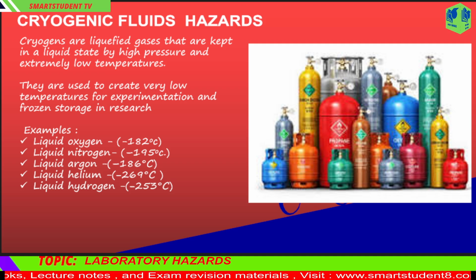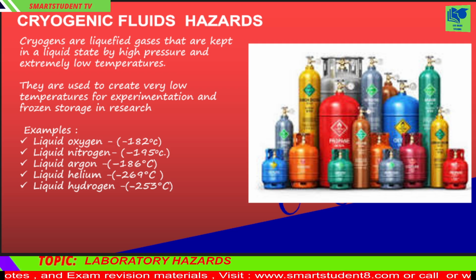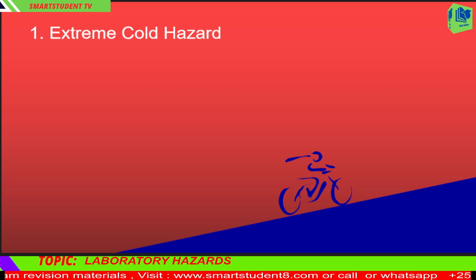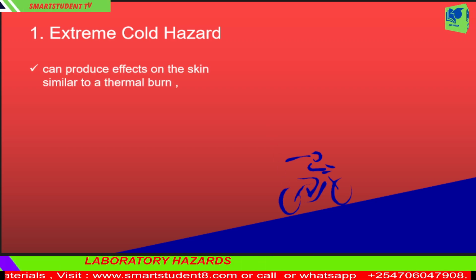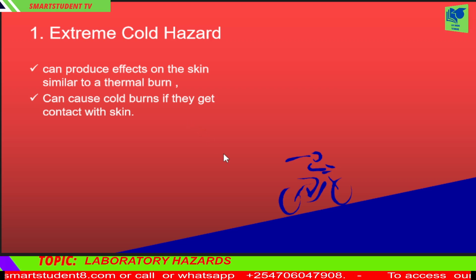There are 3 groups of health hazards associated with cryogenic liquids: extreme cold, asphyxiation, and toxicity. 1. Extreme cold hazard. Cryogenic liquids and their associated cold vapors and gases can produce effects on the skin similar to a thermal burn. They also cause cold burns if they come into contact with skin.